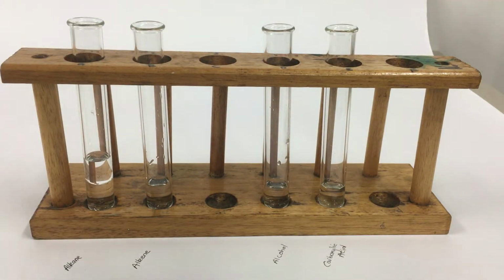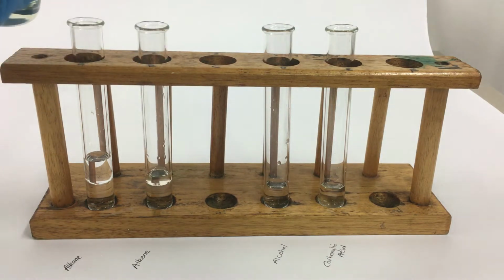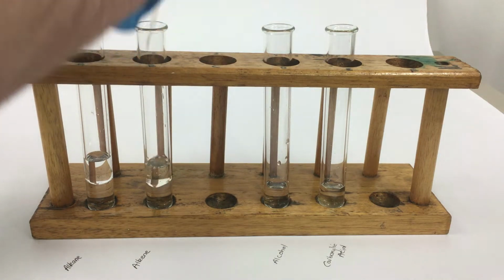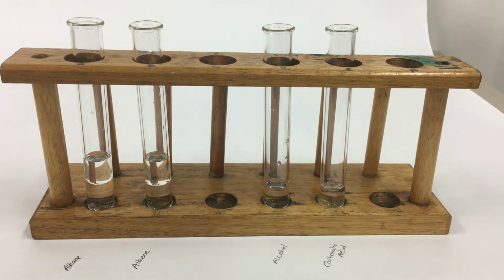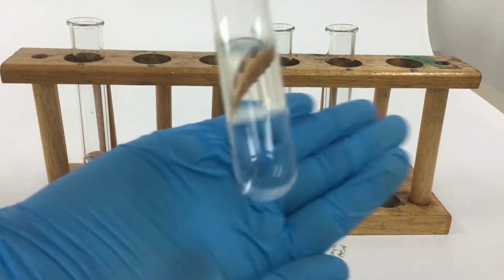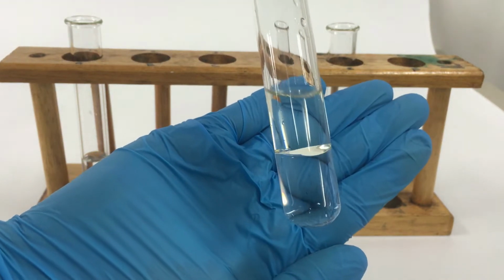An alkene, we're using cyclohexene for this one. Now, as we go, we're getting rather the same reaction. So it's sitting on top of the water as a distinct layer.